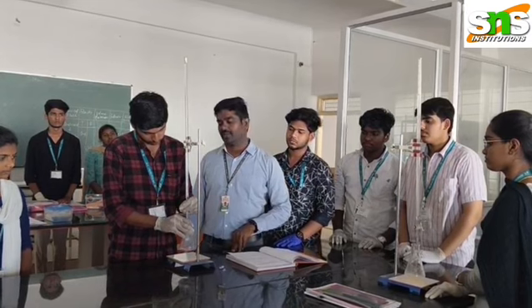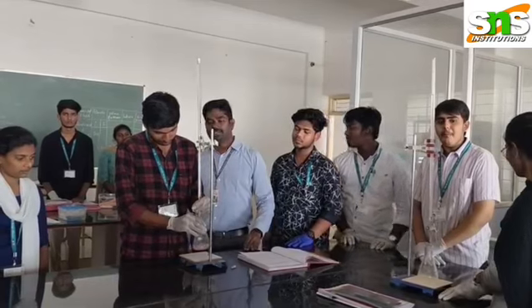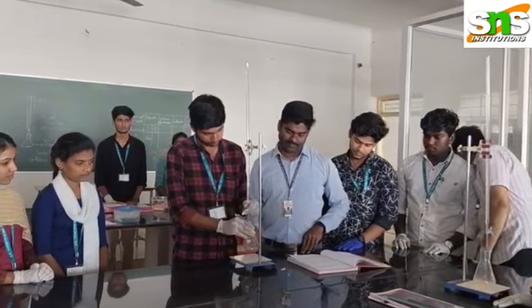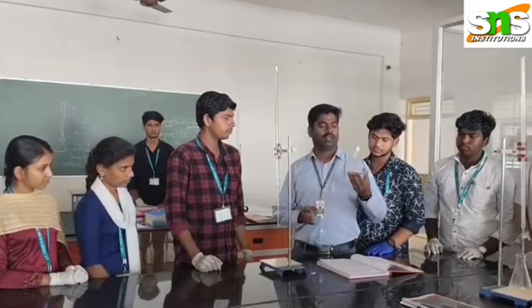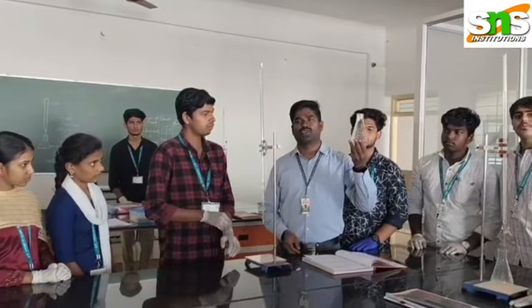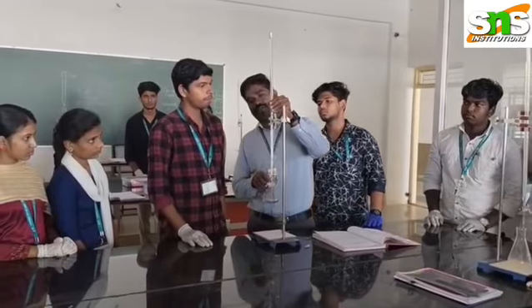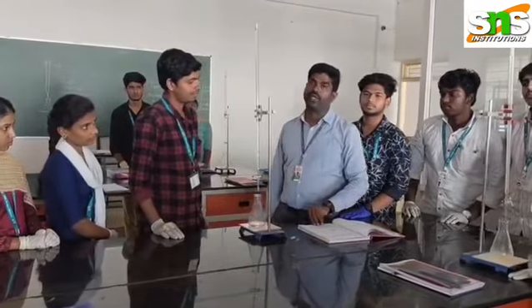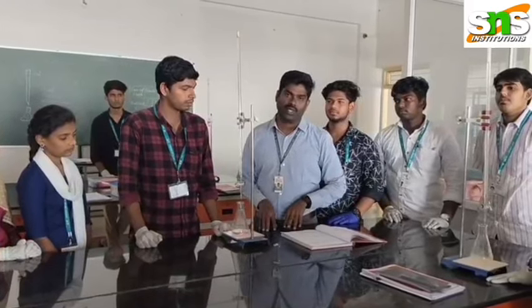Also, you can see my student performed this volumetric titration in an outstanding way. He found the end point also. We got a pale permanent red color. This color is very similar to strawberry red actually. The end point we got is around 24.9. So we found the titrate value.